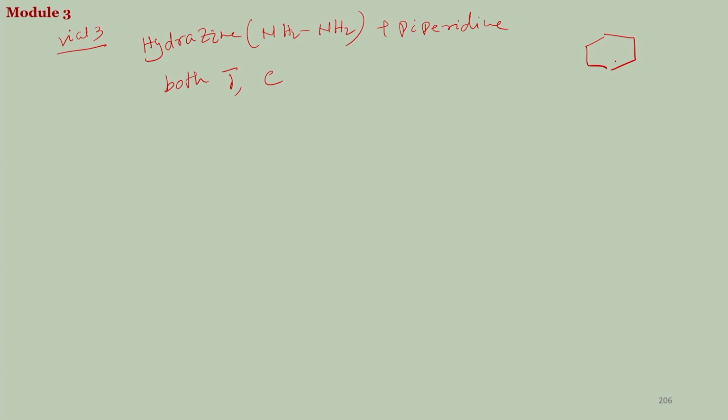I will show with just one example. If it is thymine, this is sugar, this NH, this is your thymine. If we treat it with hydrazine, so if you treat hydrazine with a carbonyl compound, it will give you hydrazones. There will be condensation reactions here or here. I will take the example of this. So, here it will form this kind of condensed product.